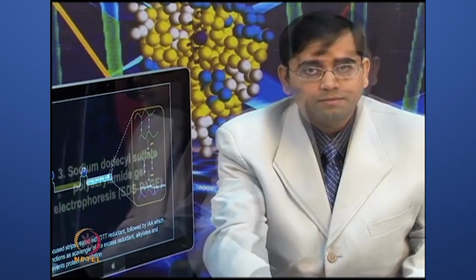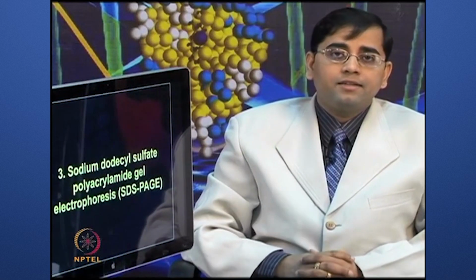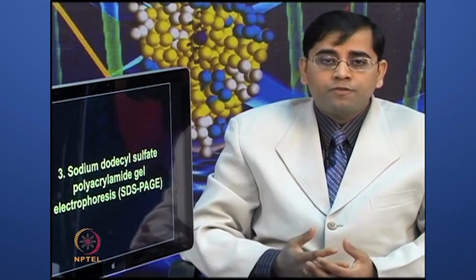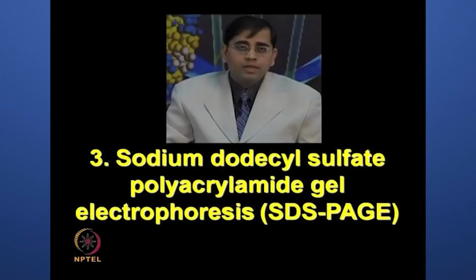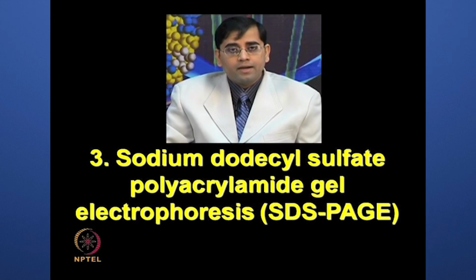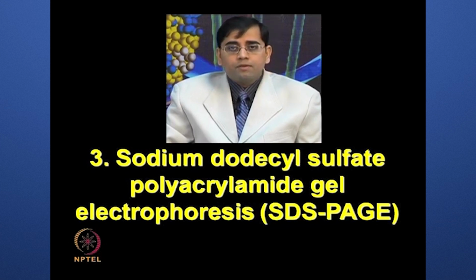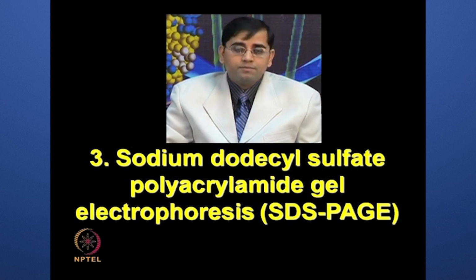Okay, after having discussed the equilibration step, now we can talk about how to perform sodium dodecyl sulphate polyacrylamide gel electrophoresis or SDS page. As I mentioned, when you perform SDS page alone for separating your regular protein extract, then you need to add both stacking and resolving gel.